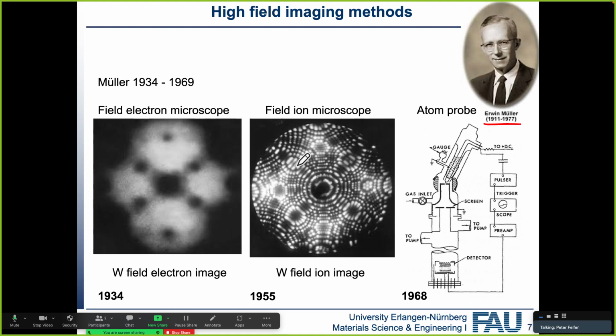And the same if you want to take an image, it took very long to expose the image, and so everything got blurred out a little bit. These days, you can pretty easily just see it by looking at it, and some of the nicest images we have from our field ion microscope are just taken by our Hiwi Erik with his mobile phone. So very simple to do.